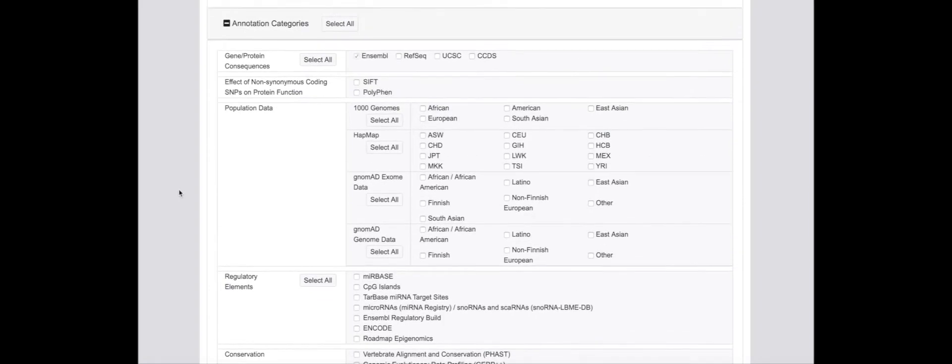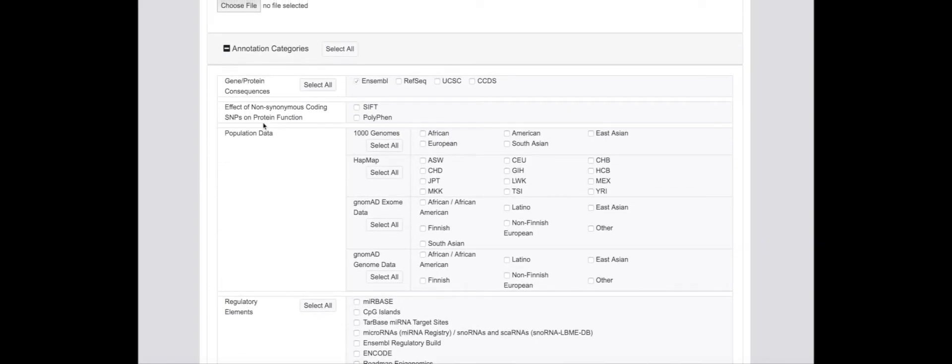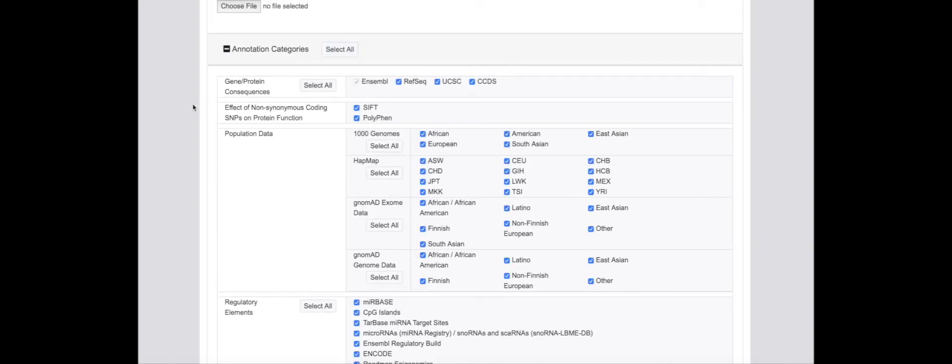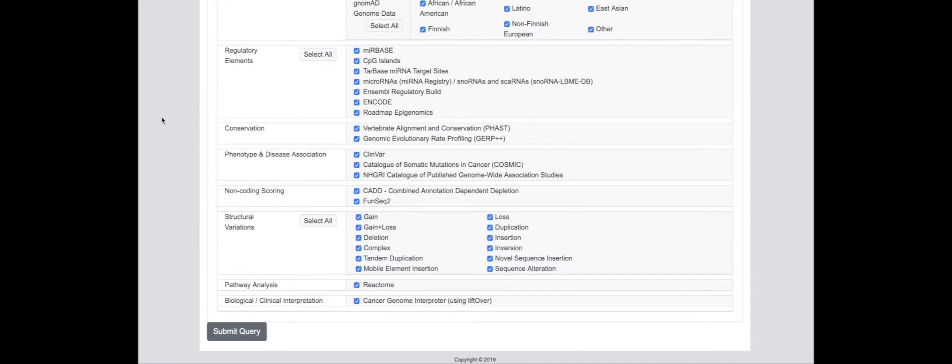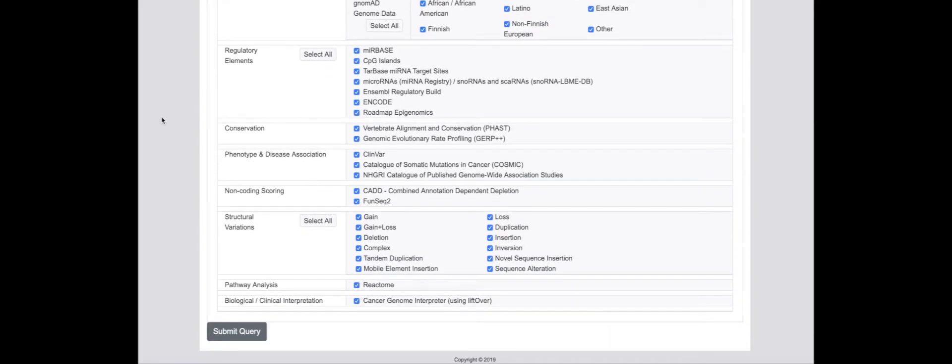Alternatively, all annotation fields can be selected to return the maximum information about a set of variants. The query can then be submitted for processing.